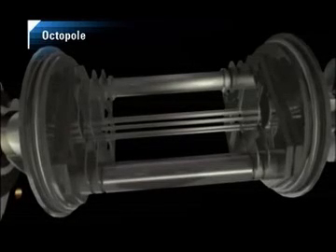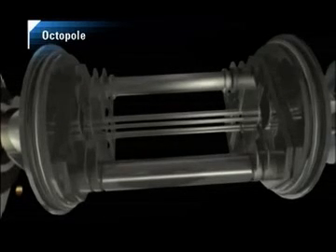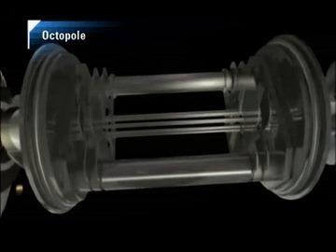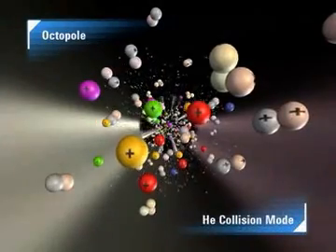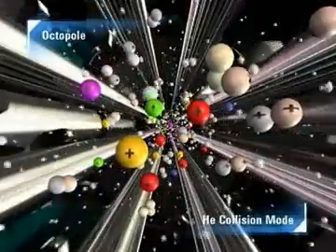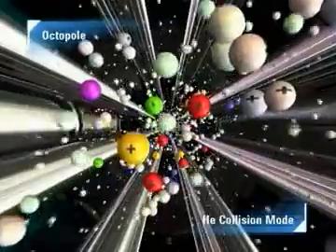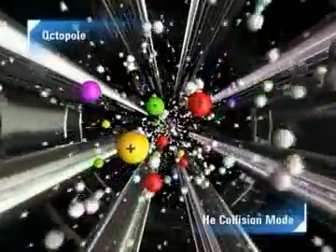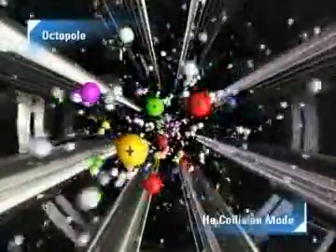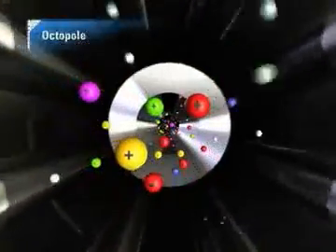This results in more ion-gas collisions and greater interference removal efficiency, which also enables the ORS to operate in collision mode using pure helium collision gas. The larger polyatomic interferences collide more often with the helium atoms than the analyte ions and lose more kinetic energy. A potential barrier at the cell exit allows only the higher energy analyte ions to pass through to the mass analyzer. The low-energy polyatomic ions are prevented from leaving the cell by energy discrimination.